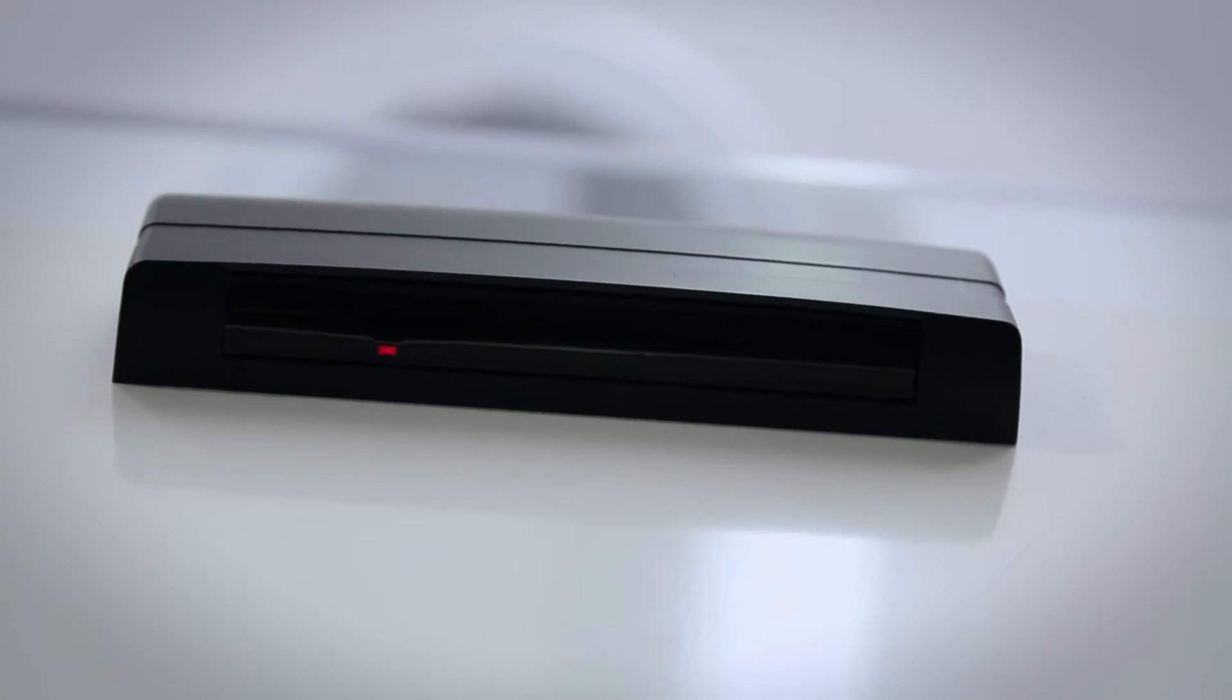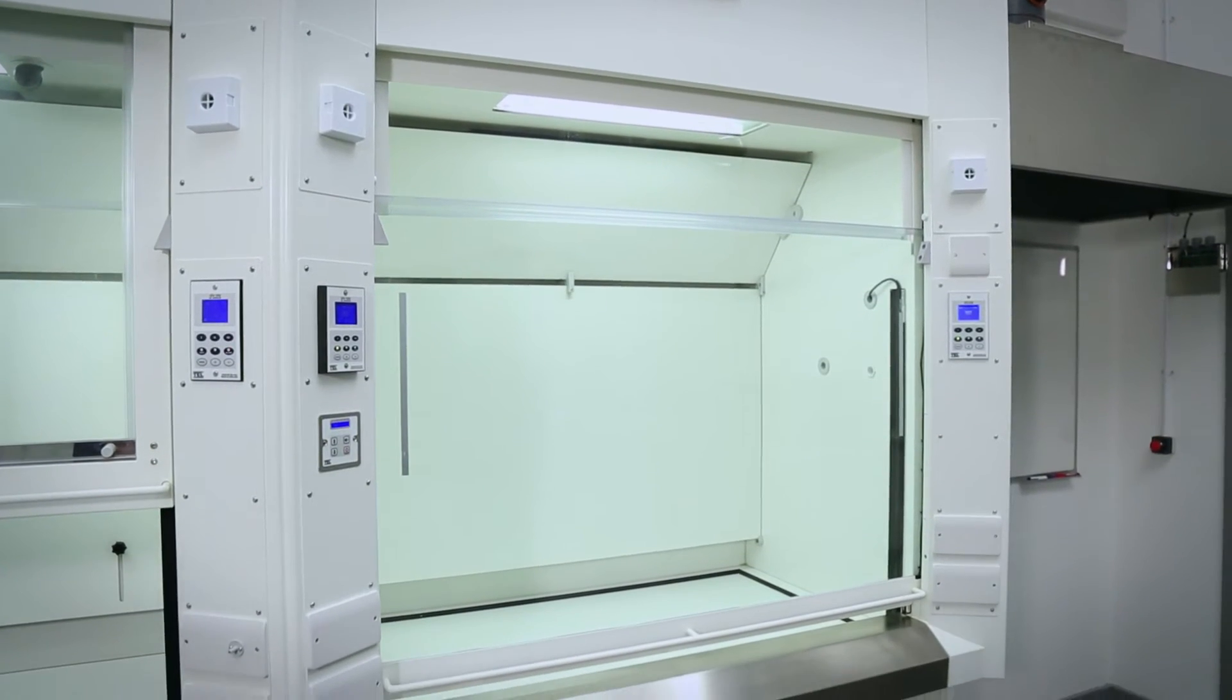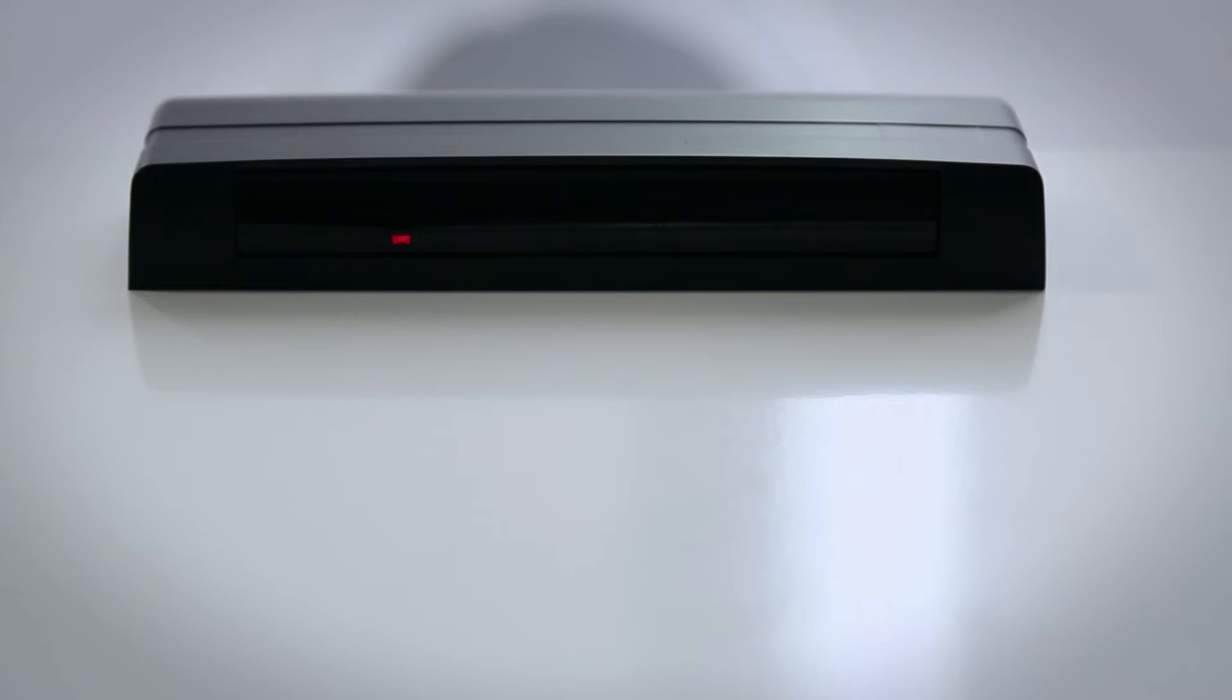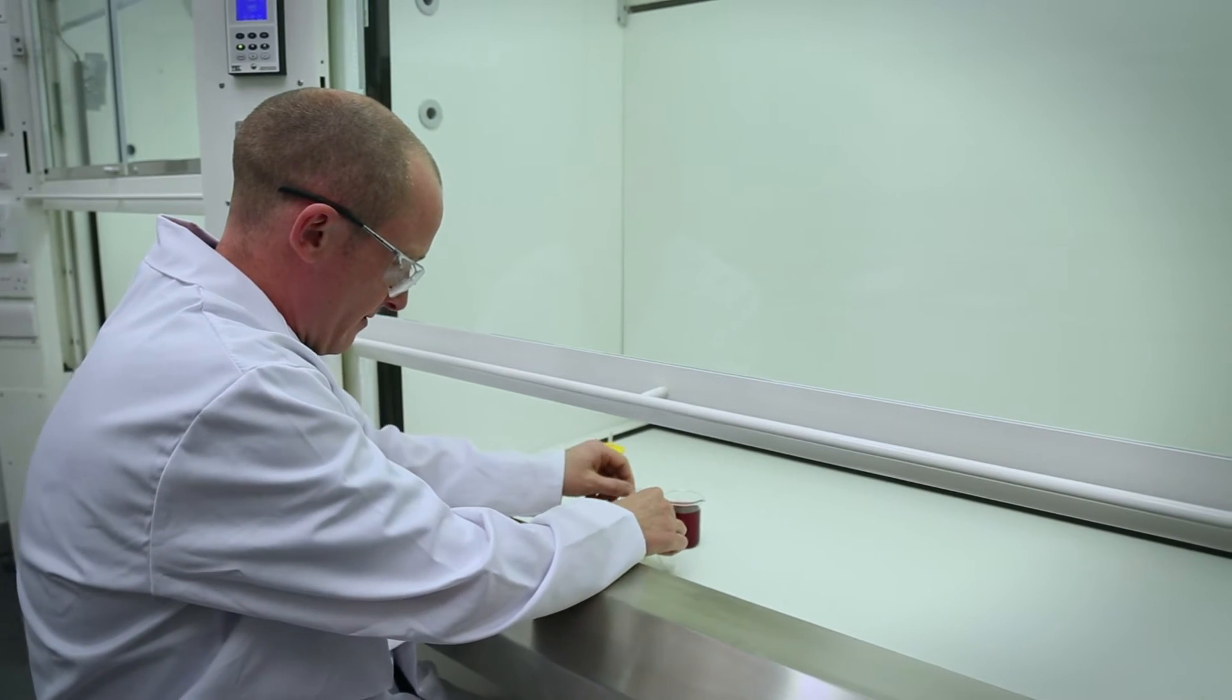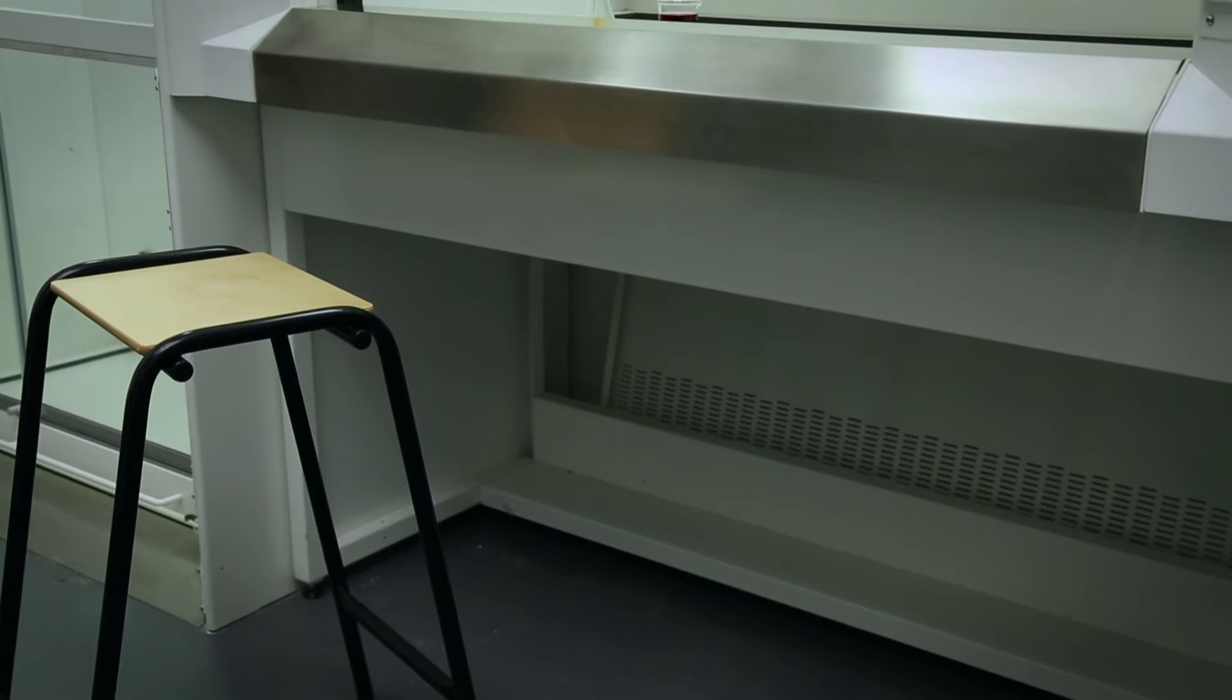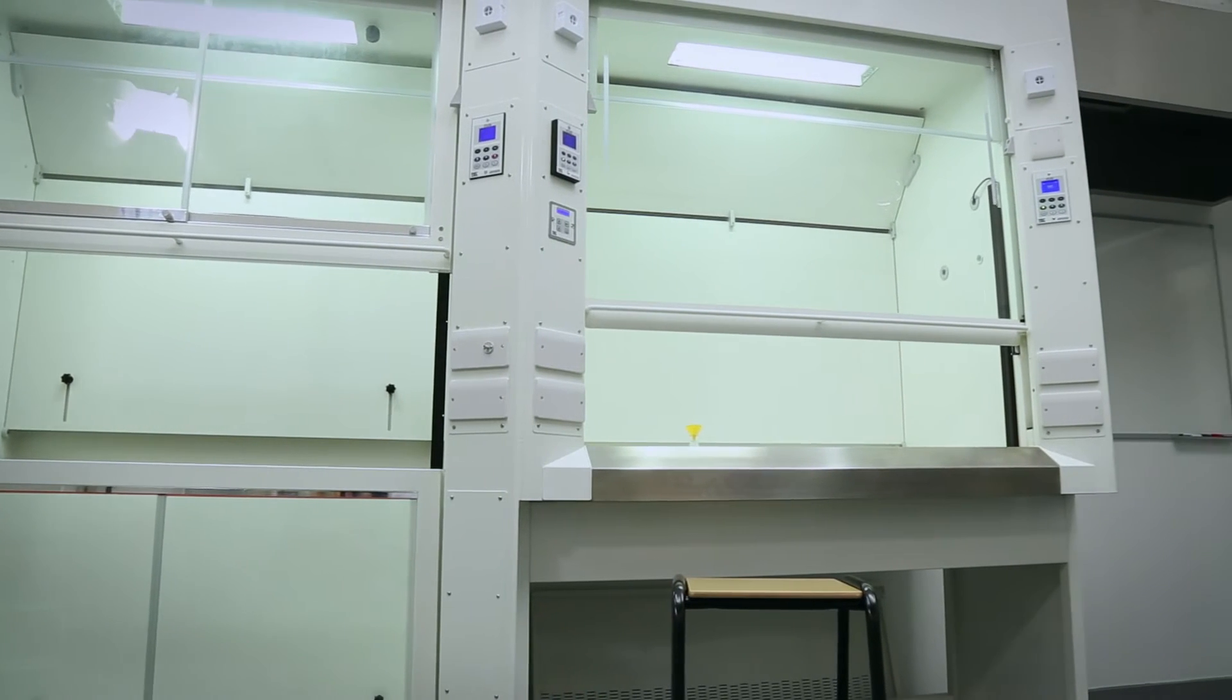This system works through a passive infrared sensor that constantly monitors the work area in front of the fume cupboard. The onboard mapping facility ensures it will detect the presence of a user without continuous movement. It will also recognize if a solid object has been left in front of the cupboard for a long period and still allow the sash to close.